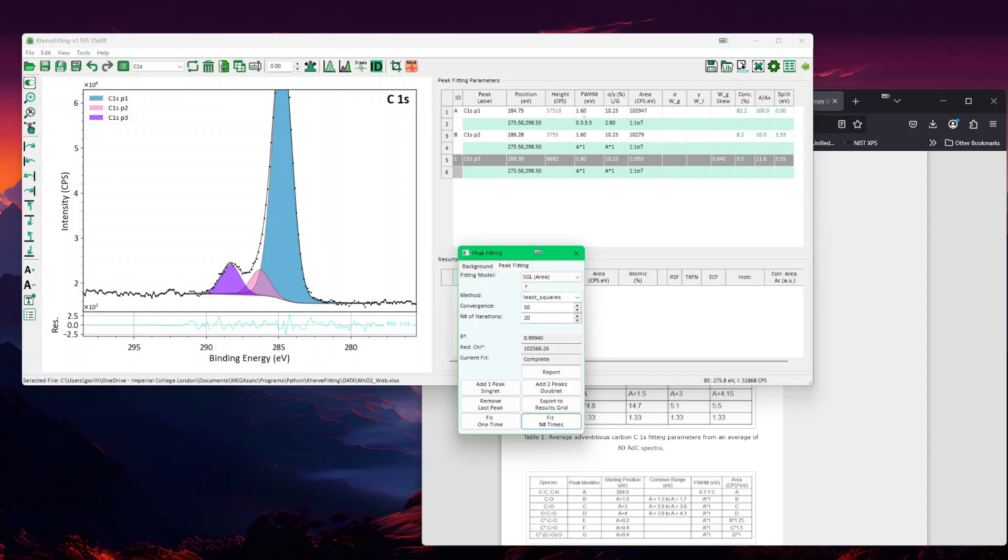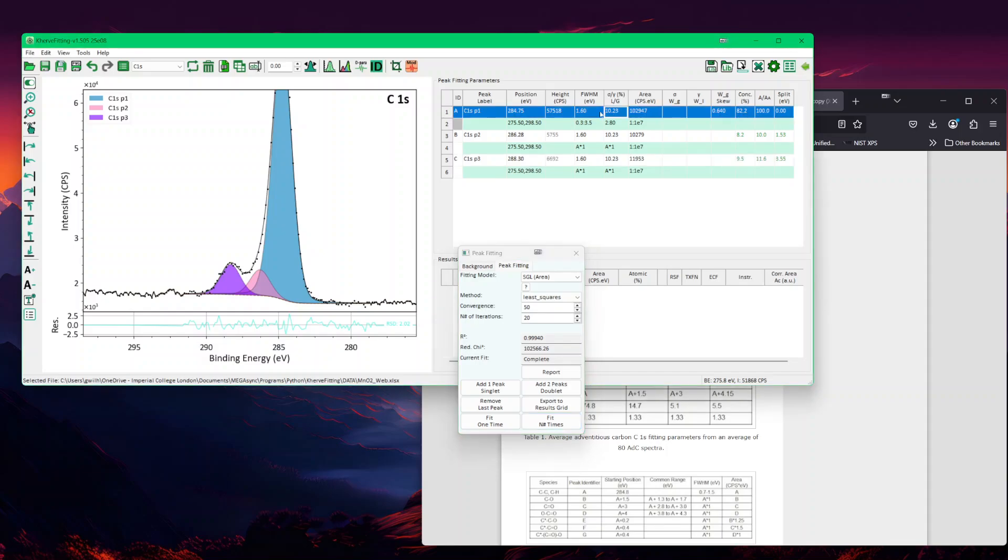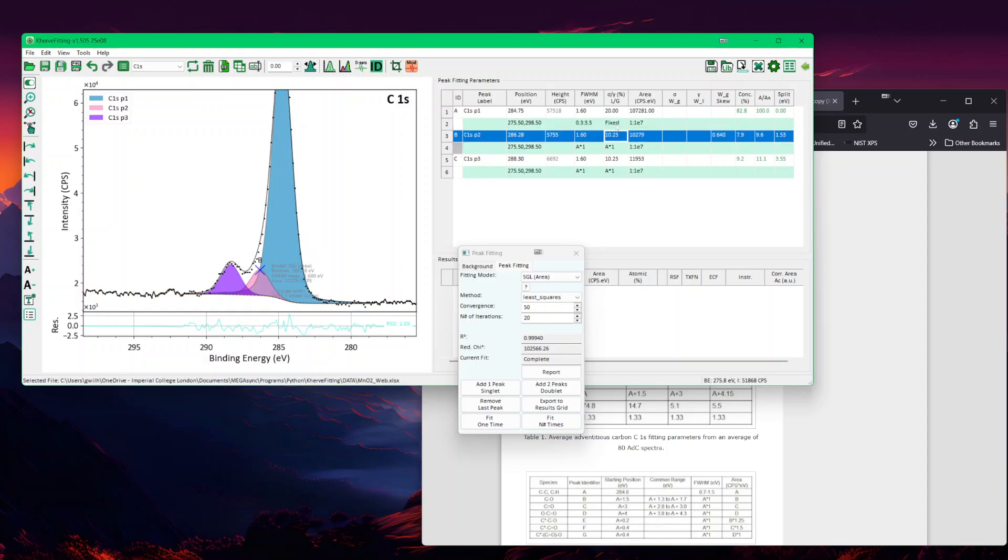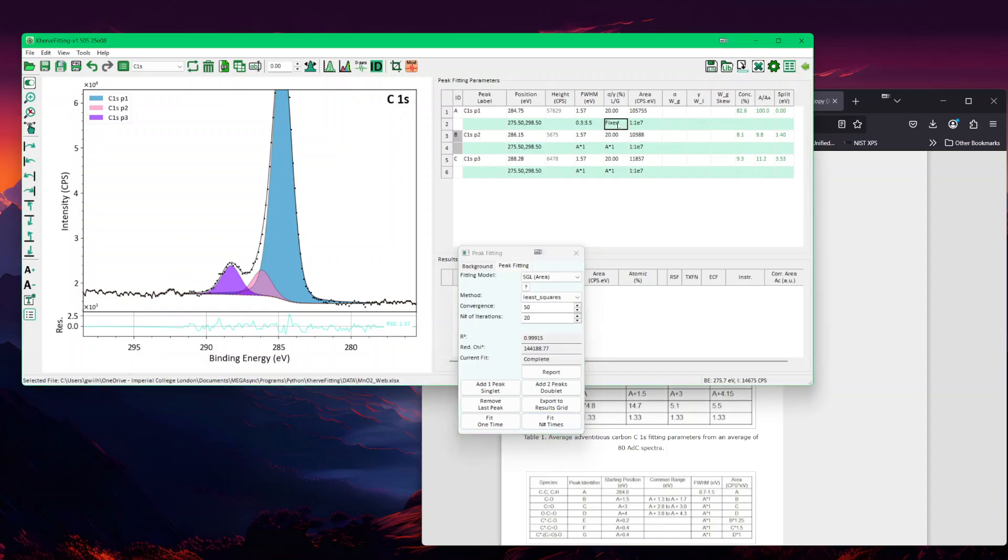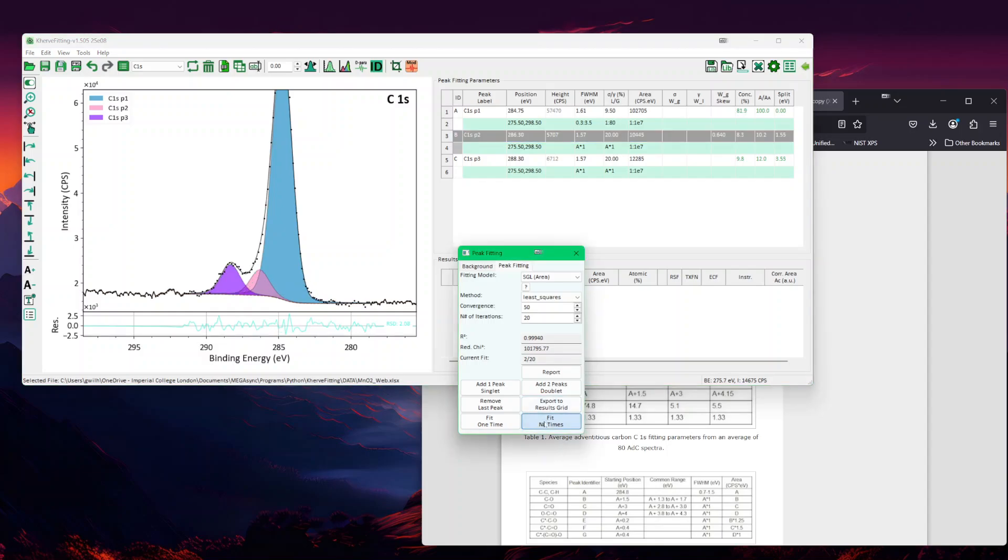The reason is because usually at one eV, it is around 20%. If the bigger the width, the smaller is the Lorentzian, so it tends to go towards zero. It's not a full Gaussian yet. It's usually never a full Gaussian. This is maybe the maximum he would go to. I could decide to put that to 20, but I do not think this would fit as well. As you can see, it went back to 2.37, so I would maybe let it vary to the way he wants to vary. As you can see now, it went down to 10%.